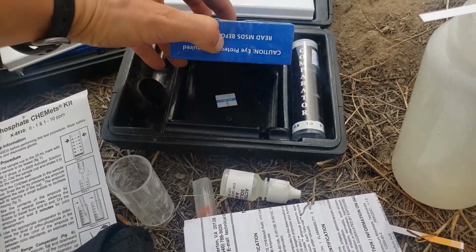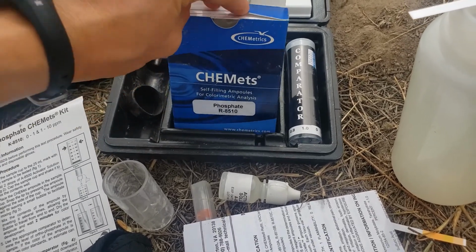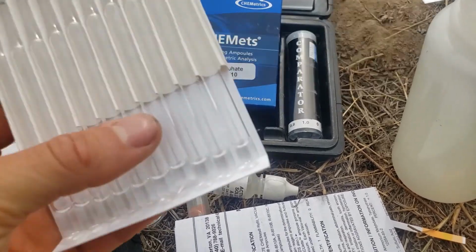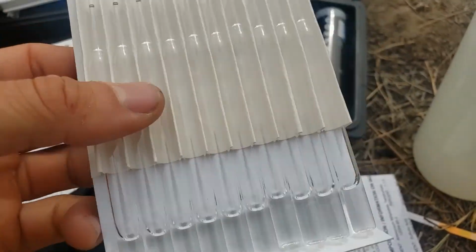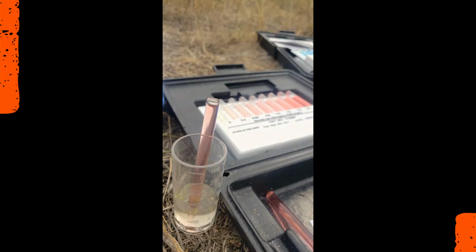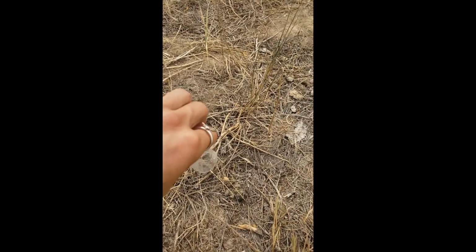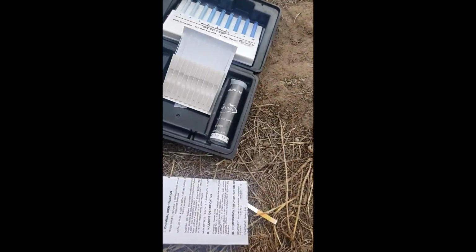So that is this one. All this is hard to do with one hand. That's okay. Ooh, pretty fun. Okay, so we can take this out. Actually, let me take a minute. I've never done this before, so let me figure out what's going on. Step one, fill this up. And I'm actually just gonna wash it out from before, so I'm gonna fill it with the water and then wash it out one more time.